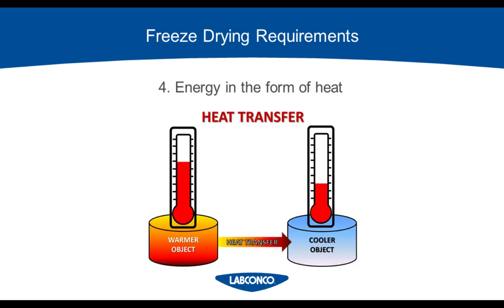The last requirement for freeze drying is having energy in the form of heat. While not obvious to a lot of people, the lyophilization process is essentially a heat transfer process. For example, with flask freeze drying, the flask is hanging at room temperature and the ambient heat from the room is what's driving the process.